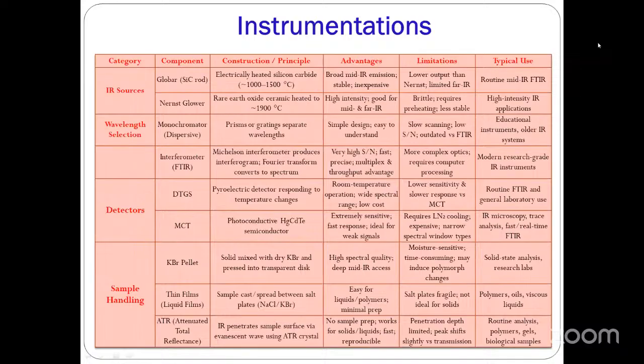And what is the important thing about the FTIR? It gives us a very high signal to noise ratio. And this is a very, very important aspect whenever we have to analyze samples containing trace amounts of impurities, analysis of impurities. As far as purity is concerned, that signal to noise ratio is considered an important parameter.